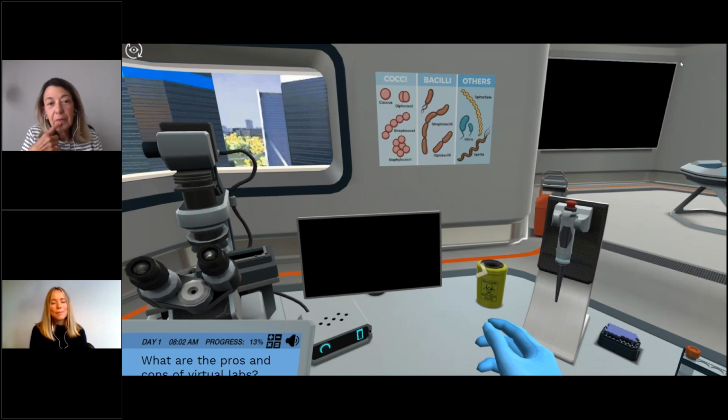And actually, that was one of the things that we liked about Labster. It's not like click, click, click, click, and everything is fine. So if you know microbiology, you know that when you spread bacteria on a plate, you have to try different dilutions because some plates may get empty and others completely full. You need to try different dilutions to get the right numbers. So that is shown in the simulation. It's not like students spread the plate and everything is pretty. They have to decide which of the different options is good. So that is obviously a con, that it is not going to replicate 100% what happens in the real lab.